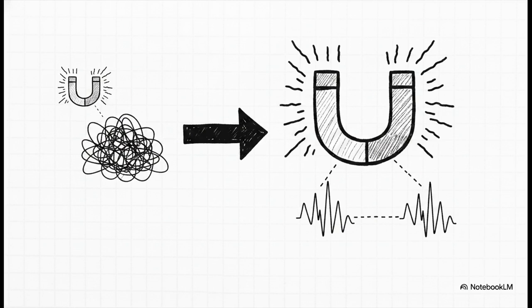So by upgrading to a high-field spectrometer, say dumping that old 60 megahertz machine for a shiny 300 or 500 megahertz beast, we artificially increase the distance between the peaks in Hertz. Since the J value stays exactly the same, we're basically artificially inflating our ratio safely past the number 6. We are literally forcing a strongly coupled second-order system to behave like a nice, weakly coupled first-order system.